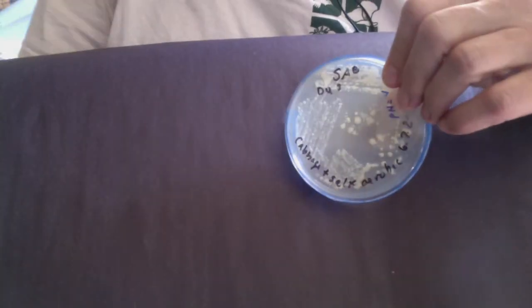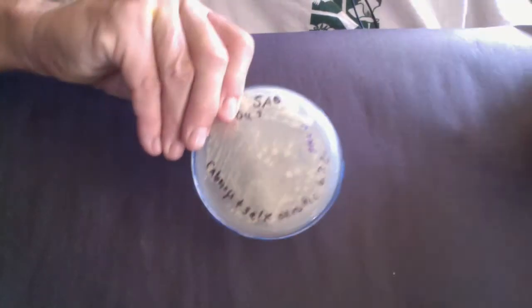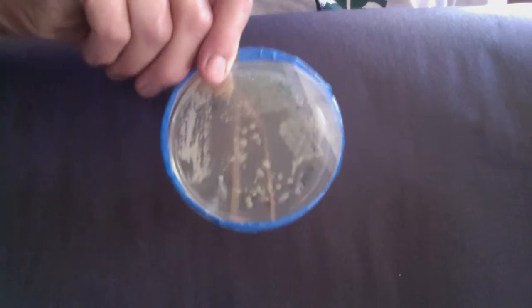And then this was after 48 hours of incubation. We can see we don't have quite the diversity — we've lost some of those beautiful pink and purple colonies. We don't have the orange colony there, so we do have some selection going on.